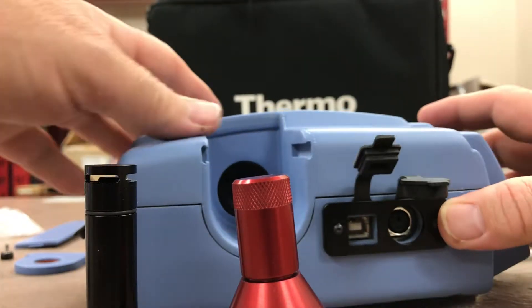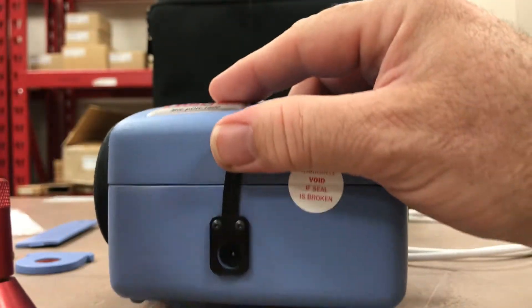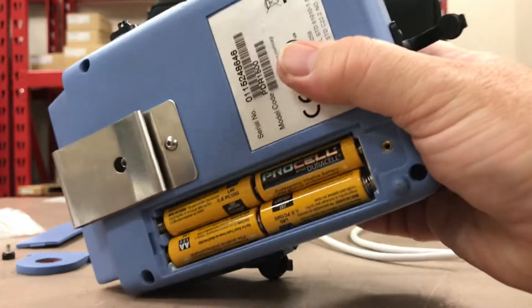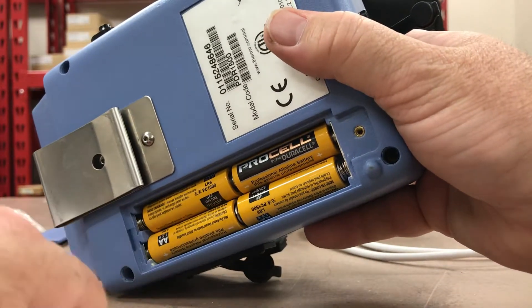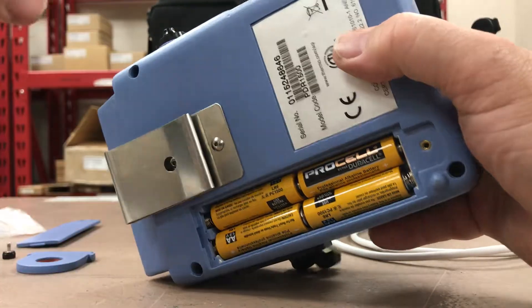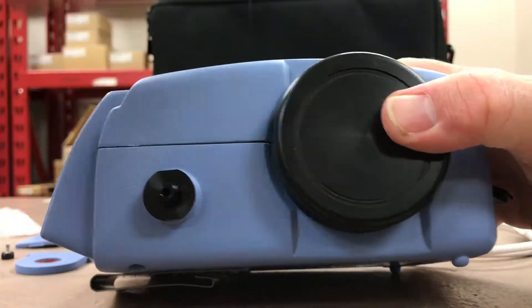Looking around the back of the unit, we have a power input — it comes with a power adapter for DC power input. This unit will also run on batteries; it can take four double-A batteries if you don't have the power adapter or don't want to use it. There's also a belt clip to carry this unit around.